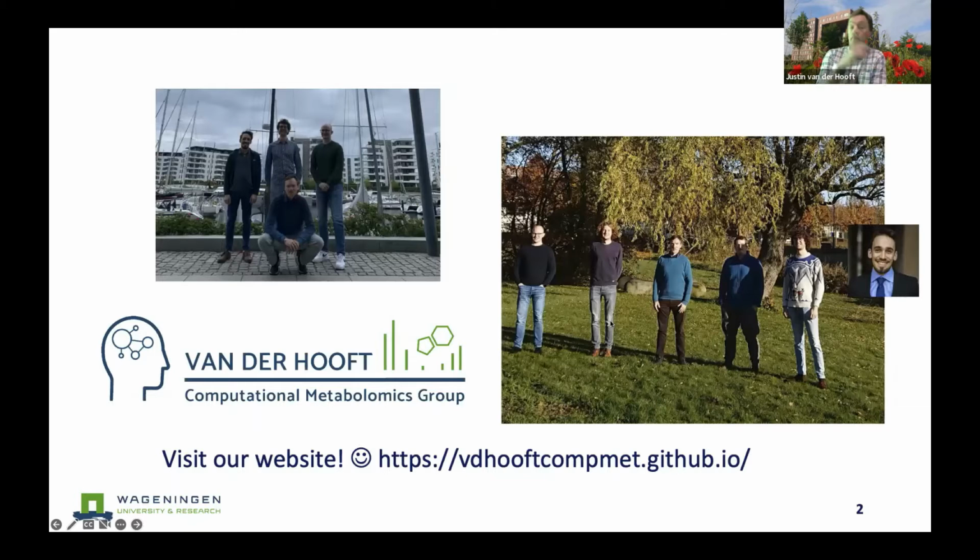So with my group in Wageningen, we apply and we develop tools to do that in the application areas of natural product mining and discovery, and also the food metabolome. But of course, these tools are more widely applicable also for the DOM example that you have this week, and also environmental sciences and other areas where metabolomics, small molecules play a role.